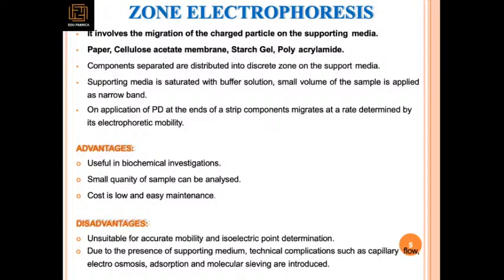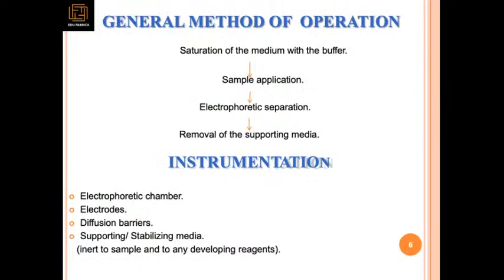The major disadvantage that we see is that it is unsuitable for accurate mobility and isoelectric point determination. You cannot check that in this method. Due to the presence of the supporting media, technical complications are possible, such as capillary flow, electroosmosis, adsorption, and molecular sieving being introduced. So all these things are possible in this case also.